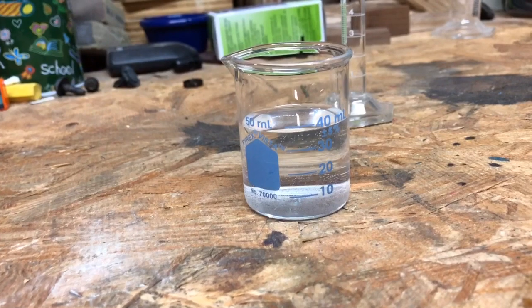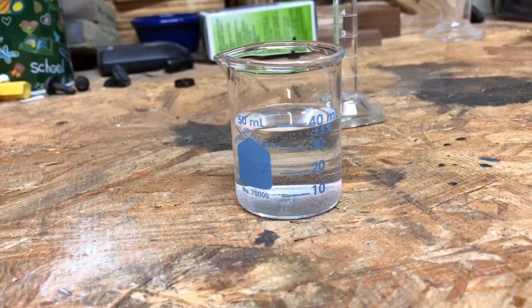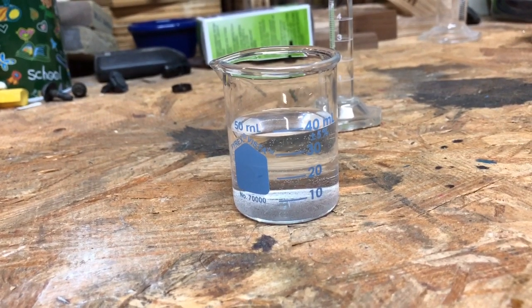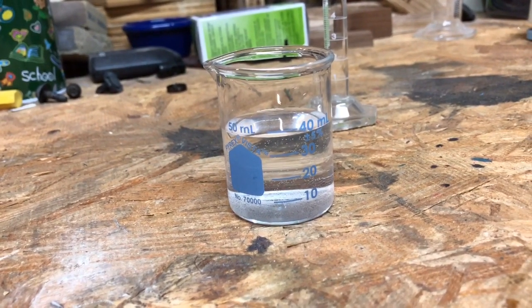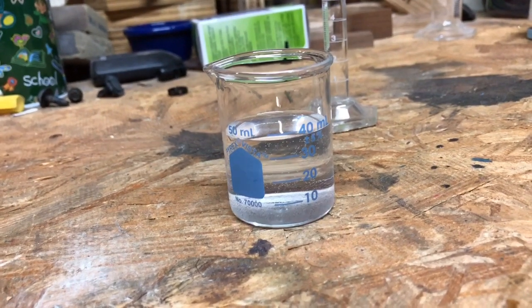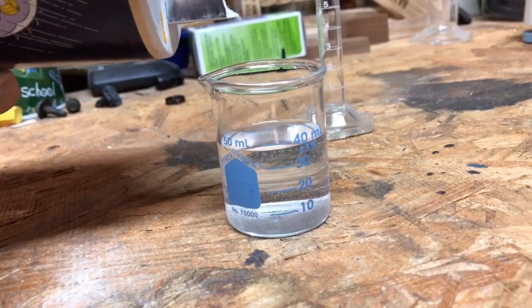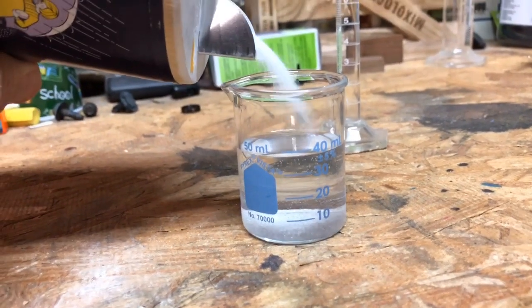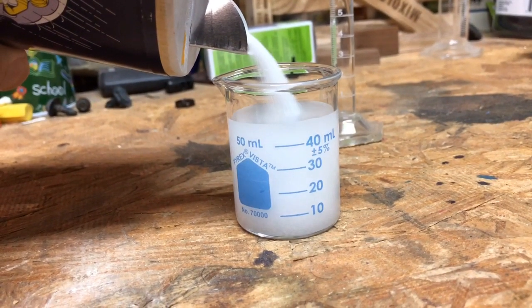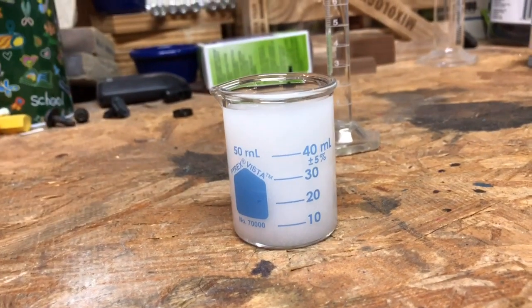When we start to create a saturated solution, how can you tell if a solution is saturated or not? We know the way you can tell is if you add a little bit more, it just sinks to the bottom. So we have to put so much in here that no more will dissolve. I'm going to start sprinkling some of this in, and I'm going to go nuts. I don't really care if I put a lot extra in. So I've added a ton to this.